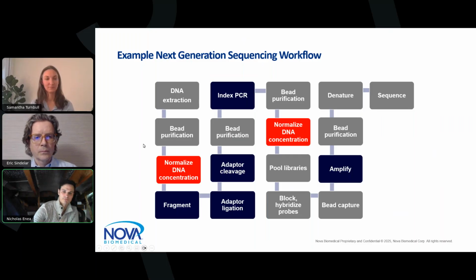There are a lot of processes in this workflow, especially in red, that if you get wrong, you're going to sequence it, look at the library yields, and see the sequencing is off somewhere, and that's going to cost a lab thousands of dollars of reagents and time, not to mention troubleshooting and going back. All these steps are really important to assess and make sure you're optimized, with the addition of the master mix, the DNA normalization steps, and the bead capture, to make sure that each of those volumes are working sequentially, accurately, and precisely.